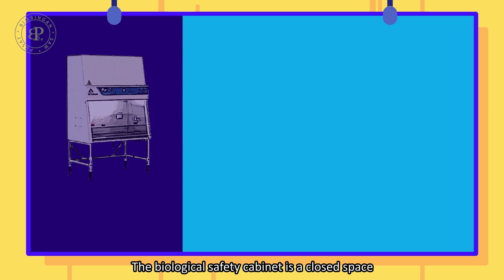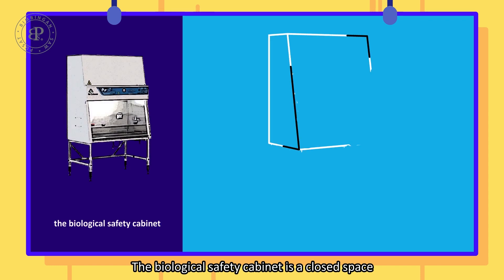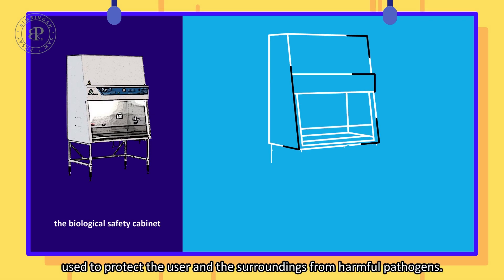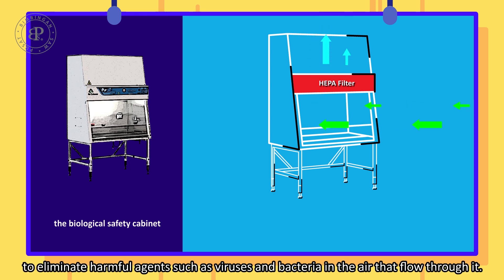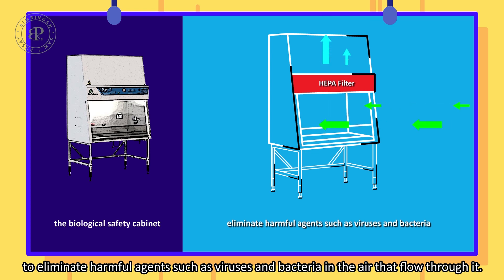The biological safety cabinet is a closed space used to protect the user and the surroundings from harmful pathogens. A HEPA filter is installed in a biological safety cabinet to eliminate harmful agents such as viruses and bacteria in the air that flow through it.